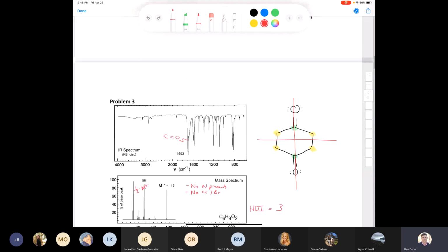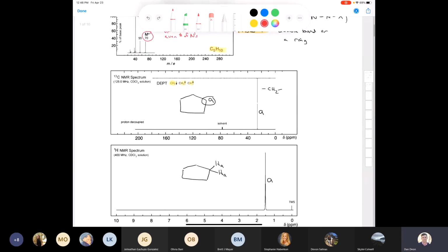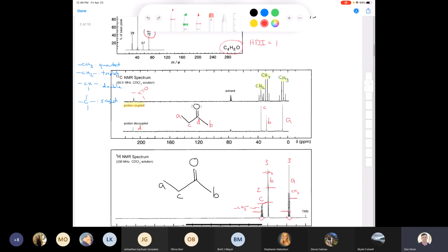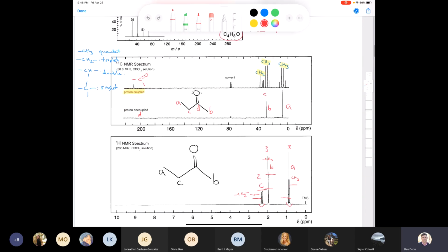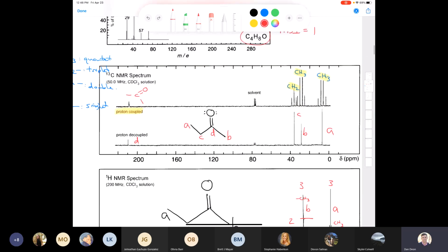Okay, so what did we do here? We started with cyclopentane, not too bad, only 1 type of signal there. Then we spiced things up. We looked at a proton coupled carbon-13 NMR spectrum. Let me just put this bug in your ear.